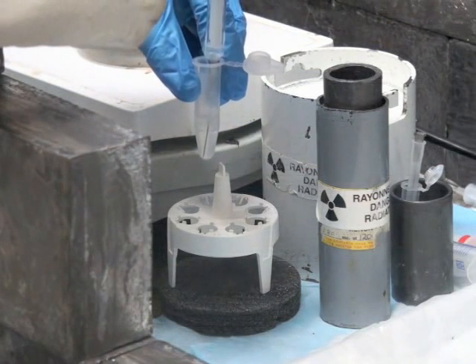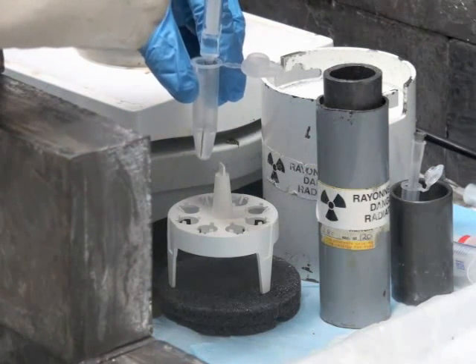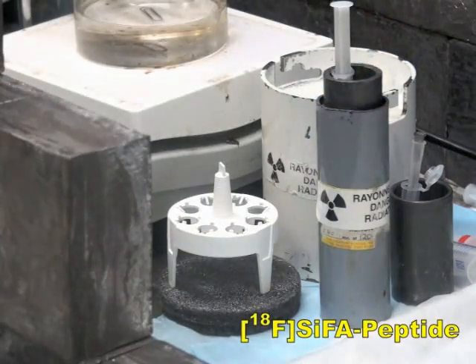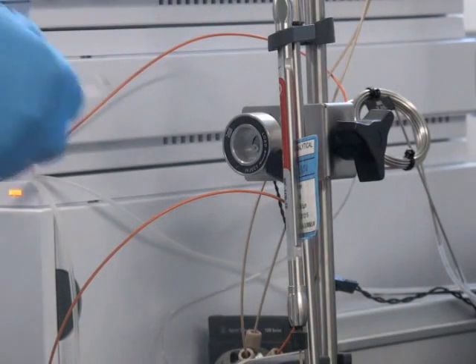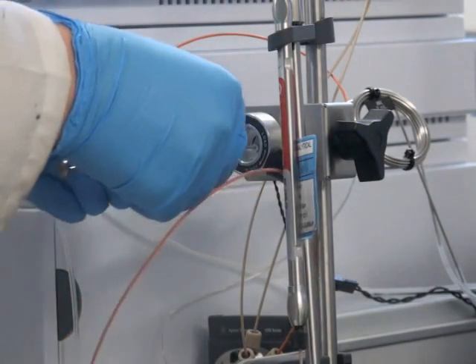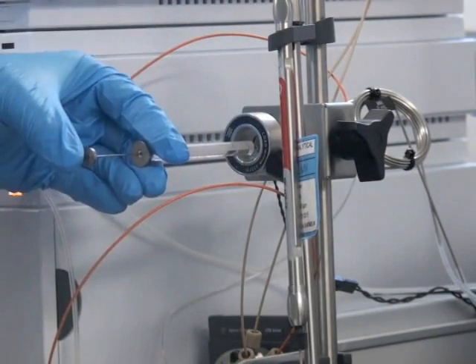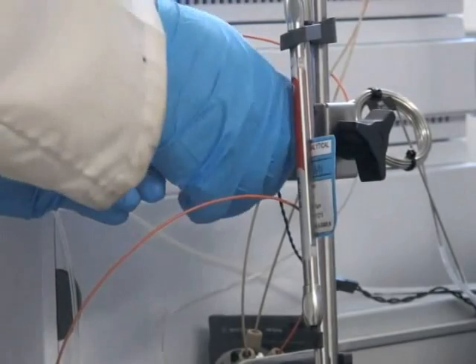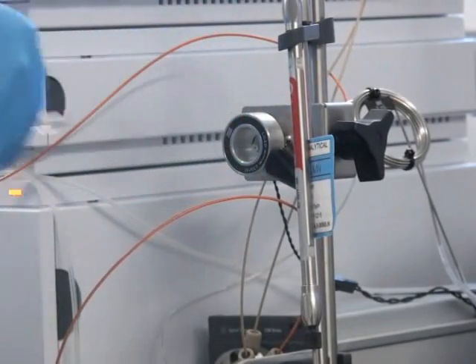To obtain a clear PET image, the final product's concentration should be between 0.5 to 2 millicuries per milliliter. Inject a small aliquot of the purified fluorine-18 labeled SIFA peptide onto a high-performance liquid chromatography system equipped with a reversed-phase C18 column to confirm that the radiochemical purity is greater than 95%.